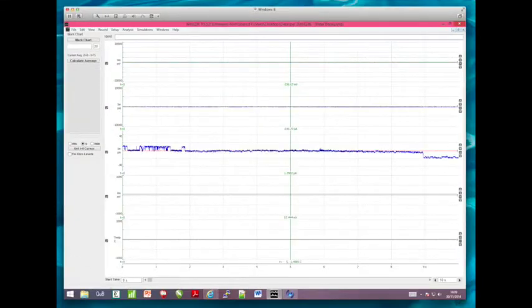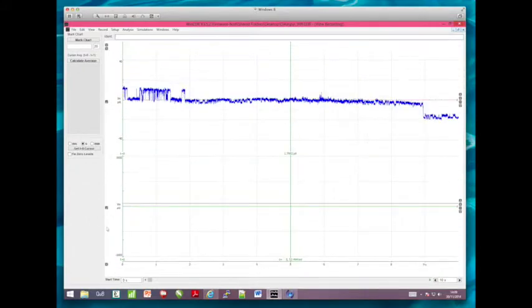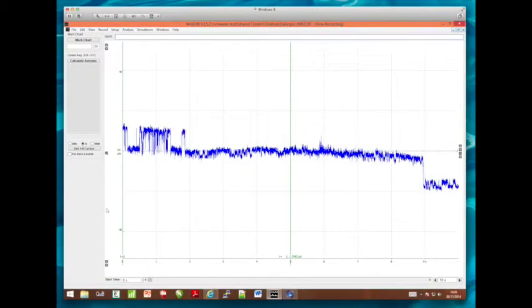Because I'm going to do single channels, I want to bear in mind what membrane potential I'm at, but I don't want to worry about the other channels that we've recorded, so I'm going to shut those other channels, temperature channels. Make a note, you can see here that we're at 57 millivolts holding potential, so I'll shut that so it's no longer confusing. And this is going to be the area where I'm waving the mouse, if this is all working properly, that I'm going to want to try and analyze the amplitude of to kick off with.